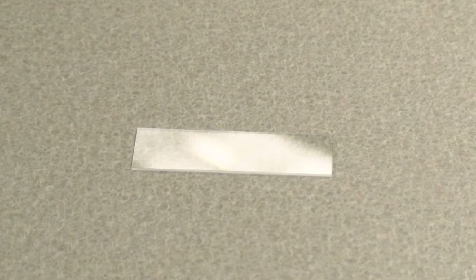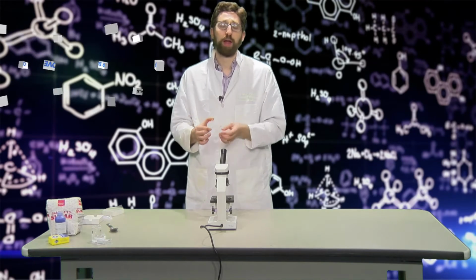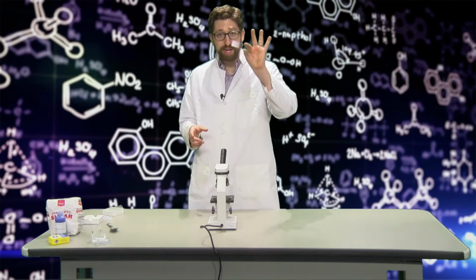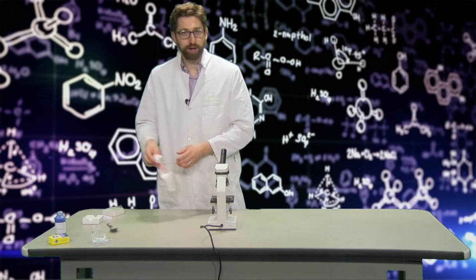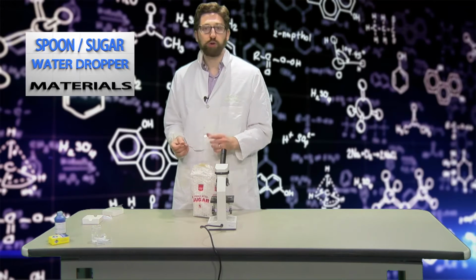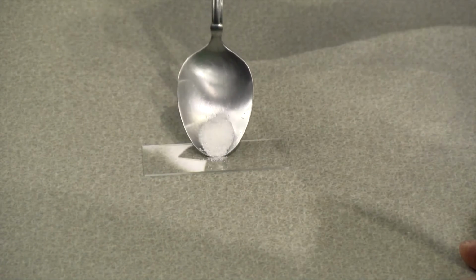When I use it, I try to hold it by the edges and not by the center because I don't want to get a fingerprint on my slide. Otherwise, when I try to look at my sample, I'm just looking at my fingerprint, and that wouldn't be so interesting. Now, I need to put my sample on the slide. Pretend I wanted to look at sugar on the microscopic level. I happen to have some sugar right here. Now, I don't need a lot because I'm just going to zoom in so far that I'll only see a few grains of sugar. So I'm just going to take a teeny little bit, barely anything, and put it on my slide.